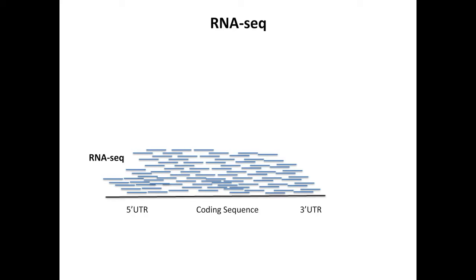So if the goal is to measure gene expression, we don't have to sequence the full transcript as people do in RNA-seq analysis. For quantification purpose, we only need to sequence a small part of each transcript, which with 3' RNA sequencing, we can do that. We can just confine sequencing to the end of the transcript. So from here, it is obvious how much saving there will be, because we wouldn't use all the sequencing materials to sequence the full transcript. We would just sequence a small fragment of each transcript.